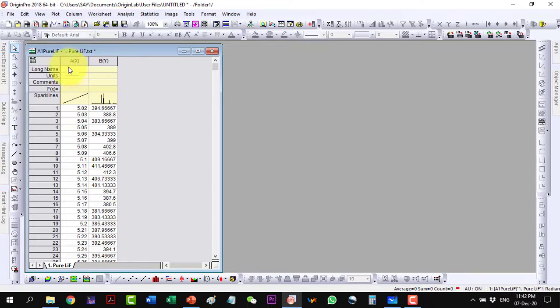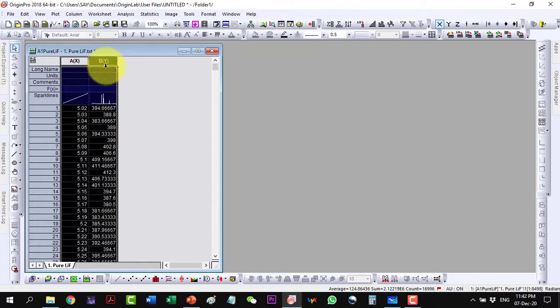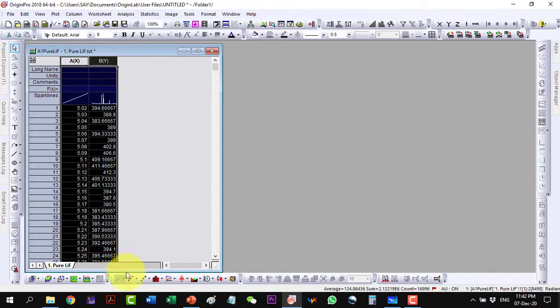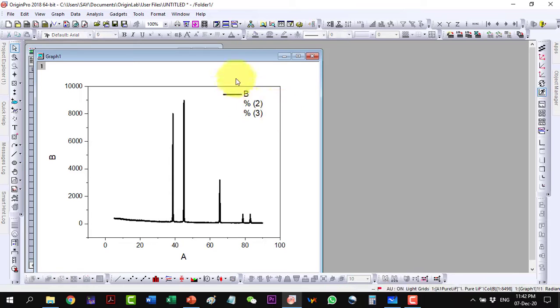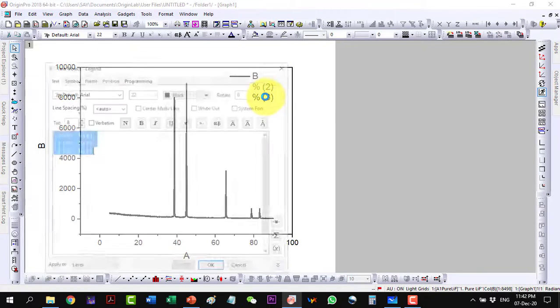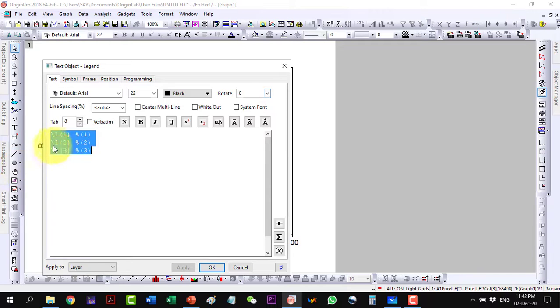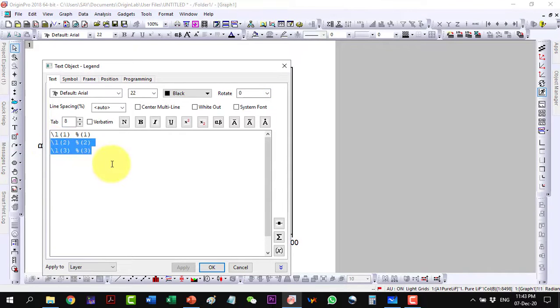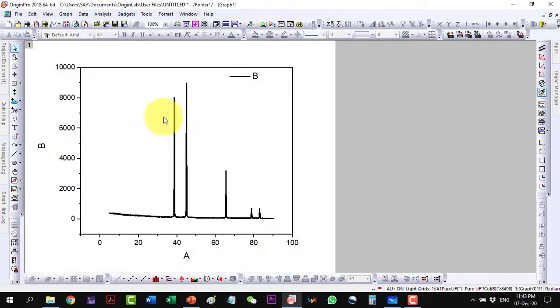I will plot this data and the data is here. I will have to correct the legends because the two legends are extra here, and now this is the data.